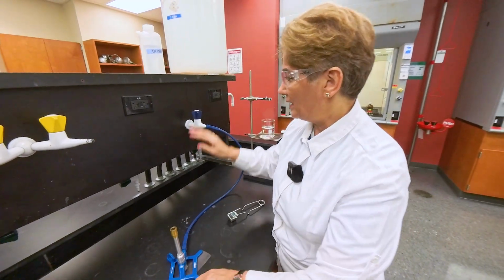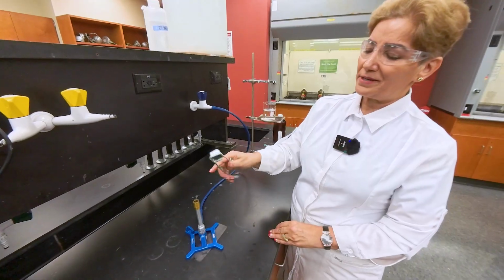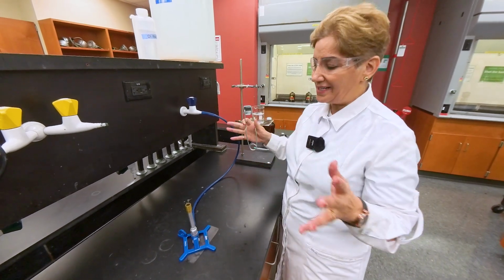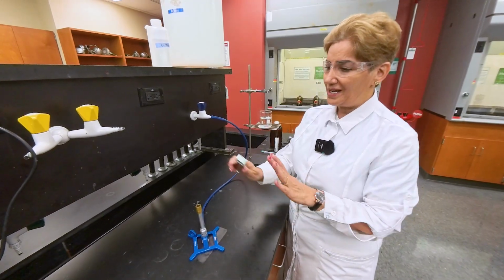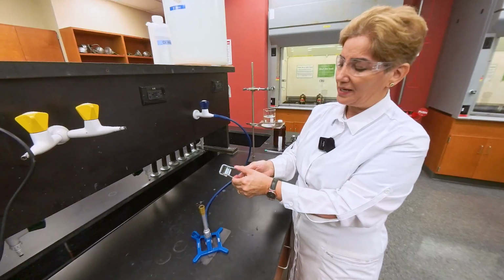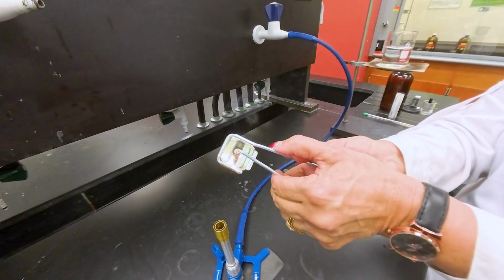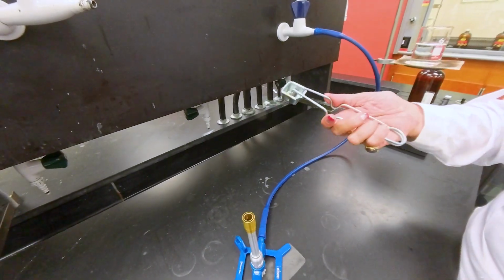Then I turn on the main gas valve. At the same time, I'm going to strike. Actually, strike before you turn on the main gas valve, because you don't want accumulation of gas in your workstation. If you have too much gas and then you strike it, it can catch on fire. So you want to make sure everything is working before you turn on the gas. You want to make sure your striker is working. The way this striker is designed, as you slide these 2 stones against one another, it generates a spark. If it doesn't generate a spark, there will be no fire.